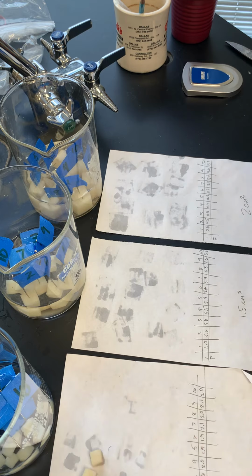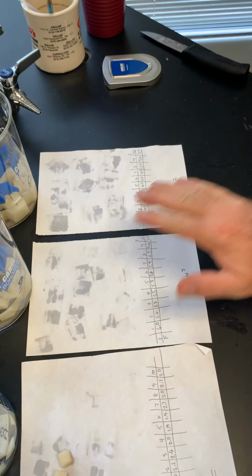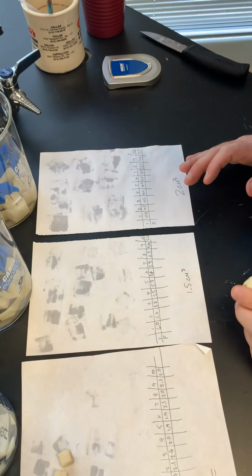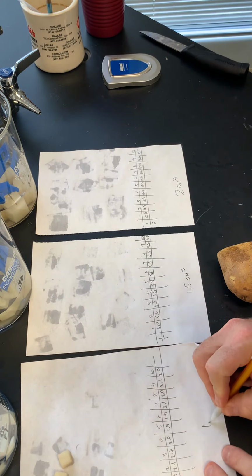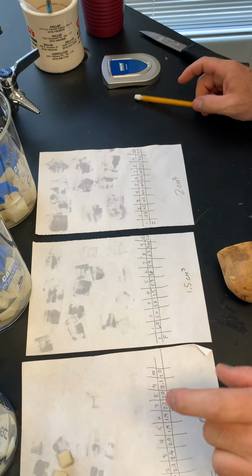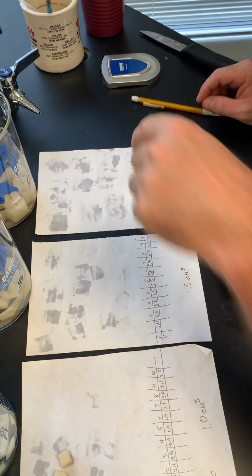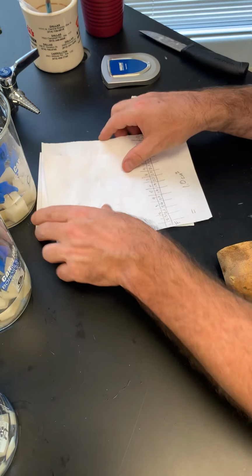So what do you do if you don't have a scale? Something that you could do instead, and I'll take this data and move it out of the way: 1 cubic centimeter, 1.5 cubic centimeters, 2 cubic centimeters. That's my independent variable that I'm going to use. Again, you can use whichever one that you want. I'll set that to the side.